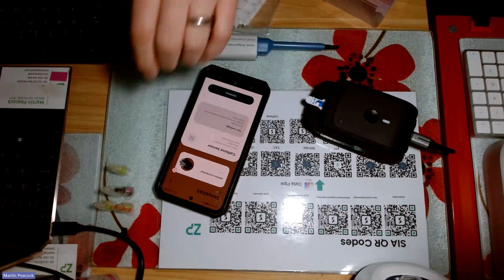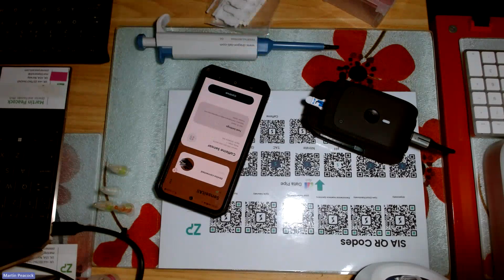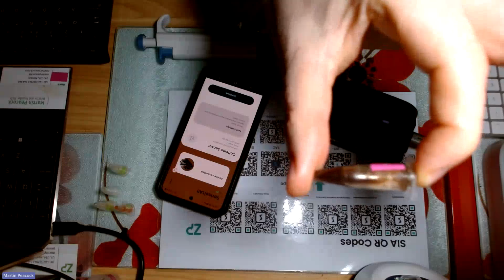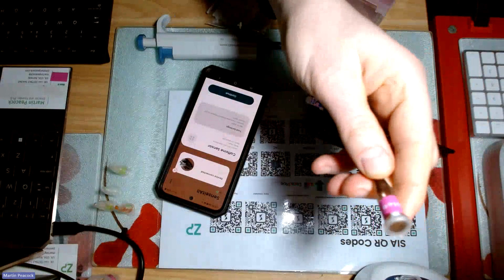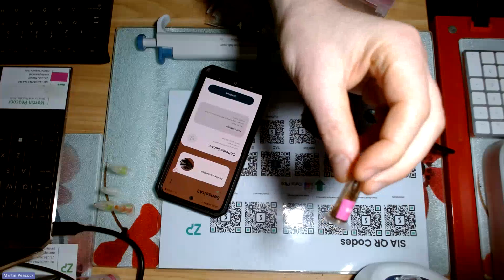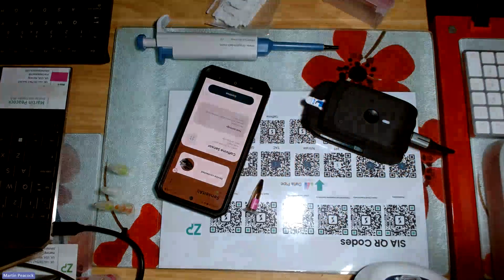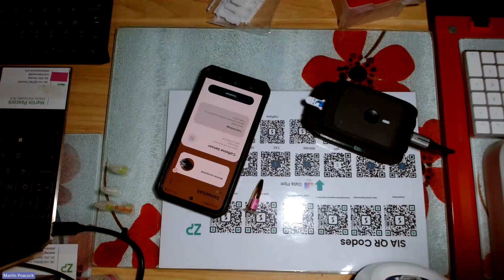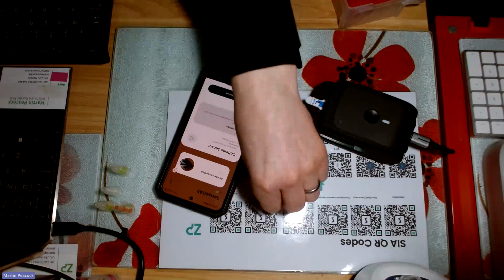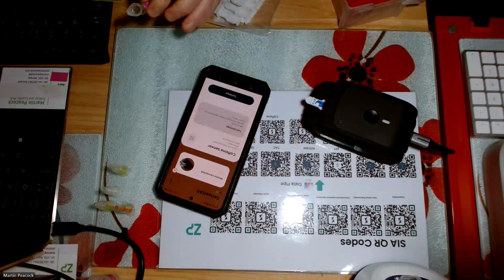So I'm just going to take a real world sample. If you're ever wondering why electrochemistry is such a powerful science, hopefully this sample alone will help to convince you. Look how dirty, brown, full of bits it is. I'm just going to get a pipette, and then I'll do the demonstration itself. So let me do that.